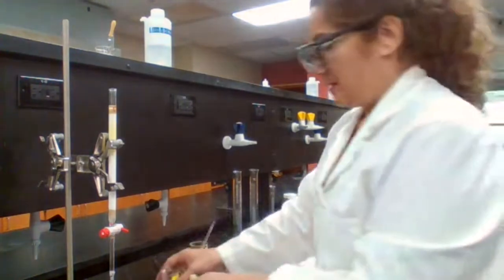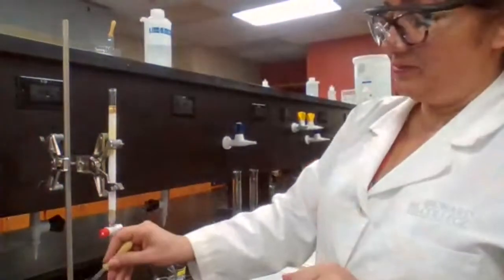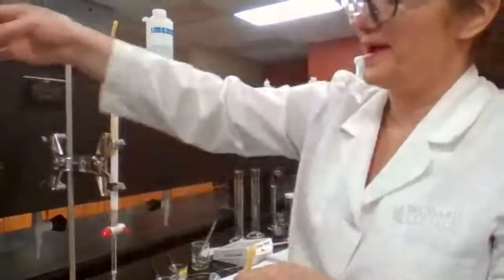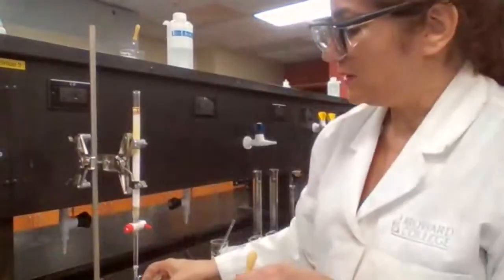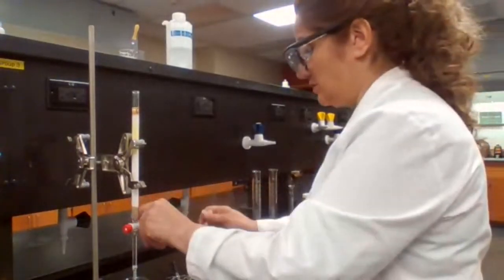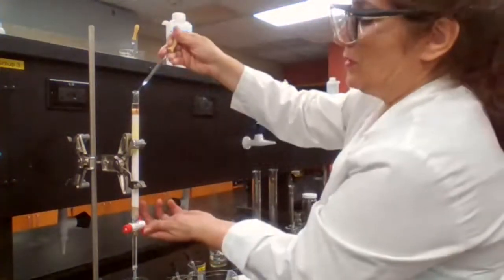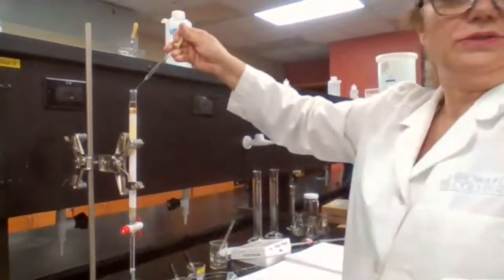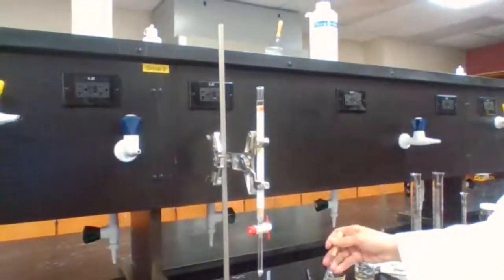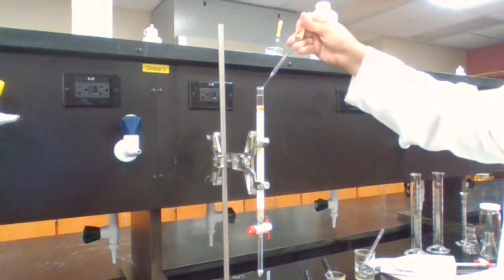Okay, what should I do next? Do I keep the fraction 1 flask here? No, switch it. So I have my fraction 1, go back to the waste container, and add the hexane acetone mixture. And can you tell me for how long I should add that? For the 9:1 hexane acetone mixture, for how long should I add that?